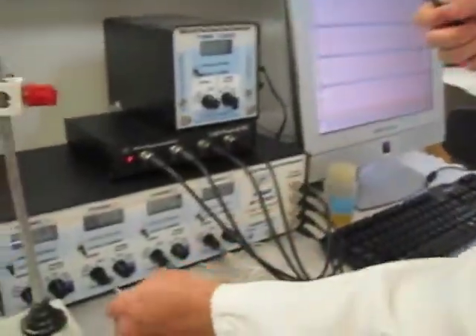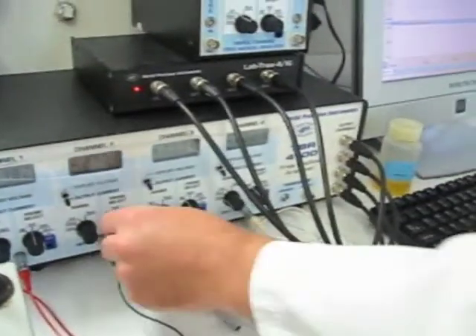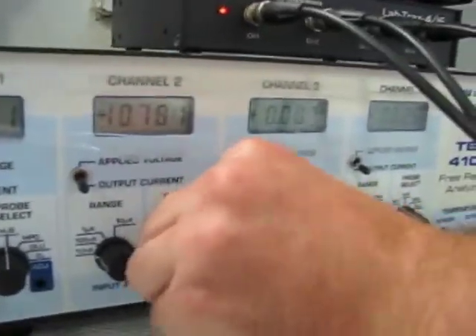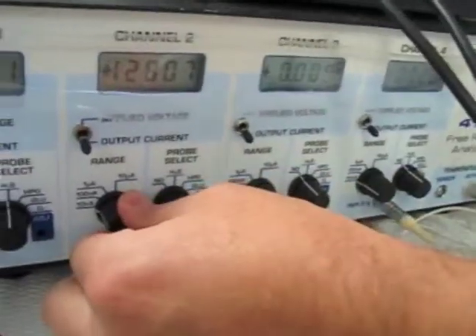Now I will take the sensor and plug this in. This is our TBR4100. I'm going to make sure I have the correct poise voltage, so I will adjust to oxygen, and we'll adjust the range for oxygen as well. So we're in the 100 nA range.